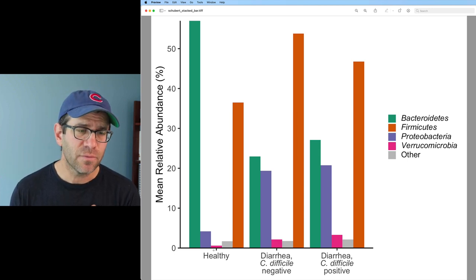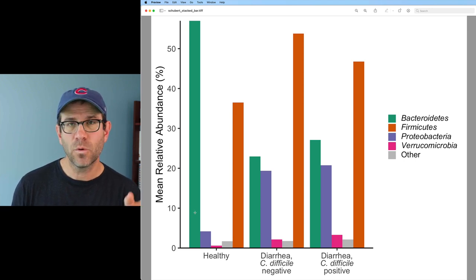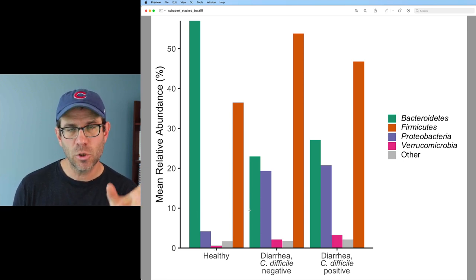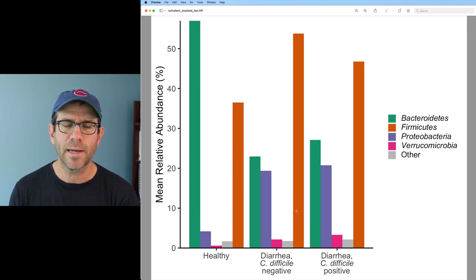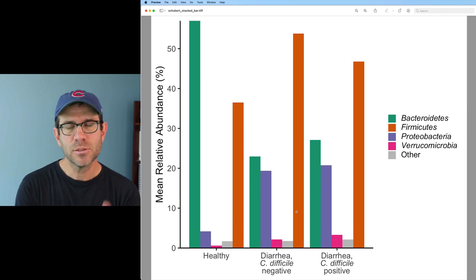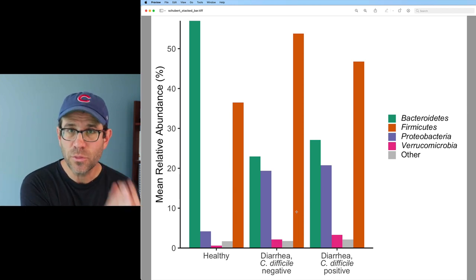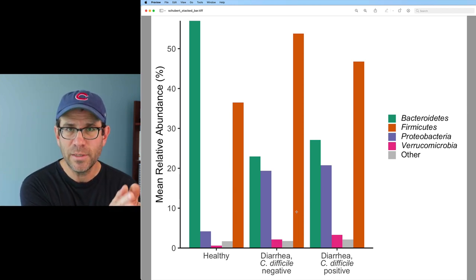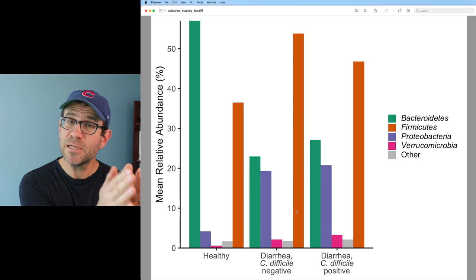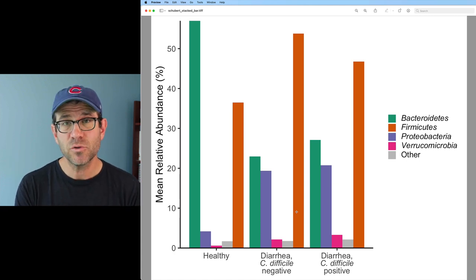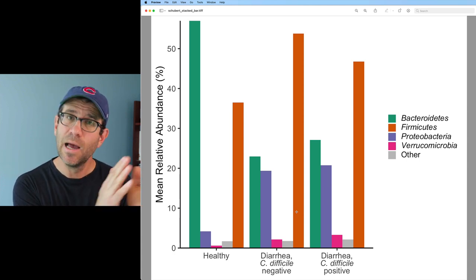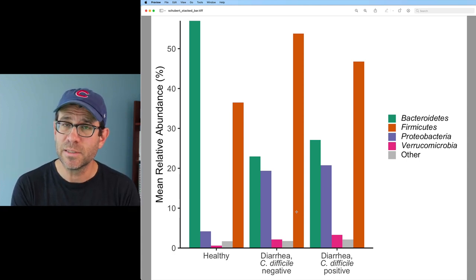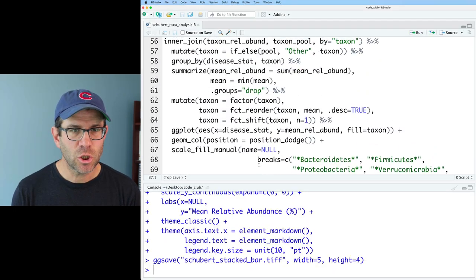Before I do that though, I want to talk about how we have our columns grouped. The grouping of these columns is not ideal. What I'd prefer to have is have a grouping for bacteroidetes, a grouping for firmicutes, a grouping for proteobacteria, verrucos, and other, right? So if I have three bars for bacteroidetes, then it's much easier for me to compare the average relative abundance of the bacteroidetes across those three disease status groups.